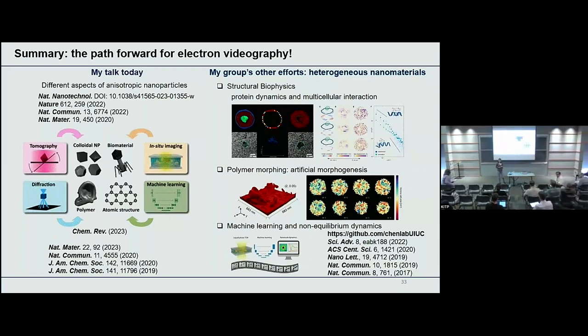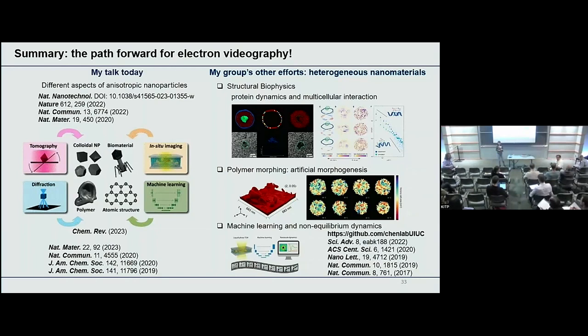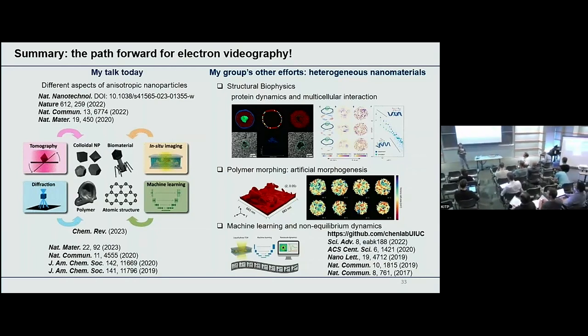So you've got this liquid cell TEM. How thick is it normally? Normally it's a few hundreds of nanometers. And your particles are much smaller. So I was just curious how you're tracking the growth, especially if it's 2D growth in that 3D space.